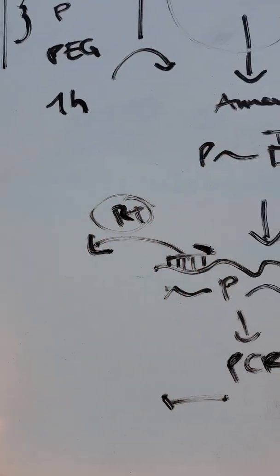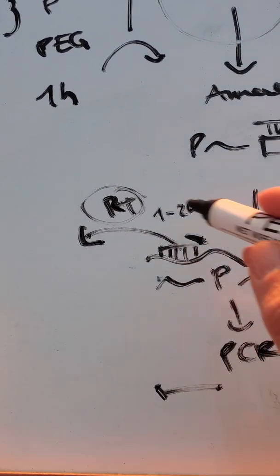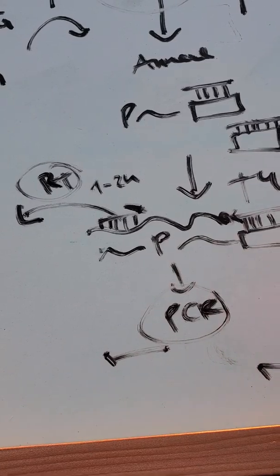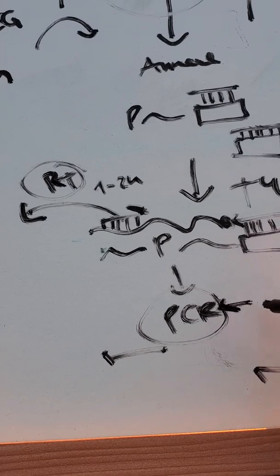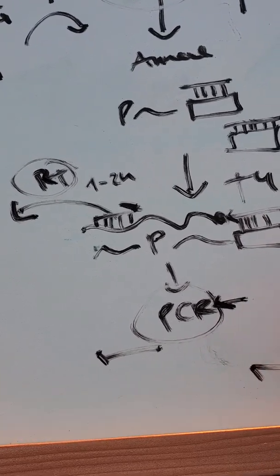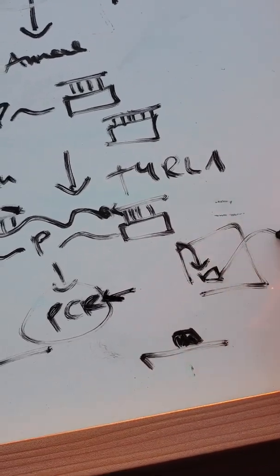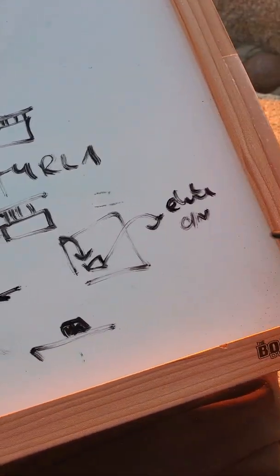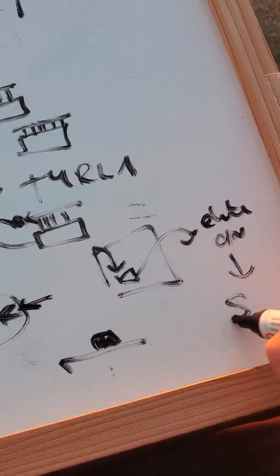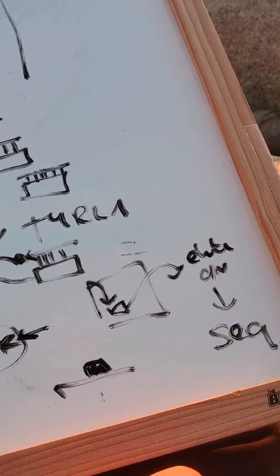So for tomorrow, we're most likely going to stop with the RT. The RT can be done for 1 to 2 hours and then just kept on ice overnight. Well, if we're very ambitious, we might even do the PCR. On the last day, we'll just need to do the PCR if we haven't done it, purify it, run it on a gel, cut it out, and then Thursday to Friday, we take the gel cut out and elute it again overnight. Or if you're very motivated, we can elute it within 20 minutes and load it on the sequencer. So this is a quick course overview. And again, tomorrow is usually the busiest day of all.